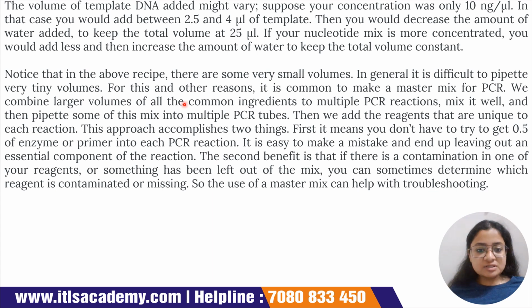Notice that in the above recipe there are some very small volumes. Like our Taq polymerase, our reverse primer, forward primer, these are all not even 1 microliter. It's only 0.5 microliter, isn't it? And that also you have to measure. You have to take it in a micropipette and then transfer it to the PCR tube, isn't it? So it's very expert and very tedious work. Okay, for this and other reasons, it is common to make a master mix for PCR.